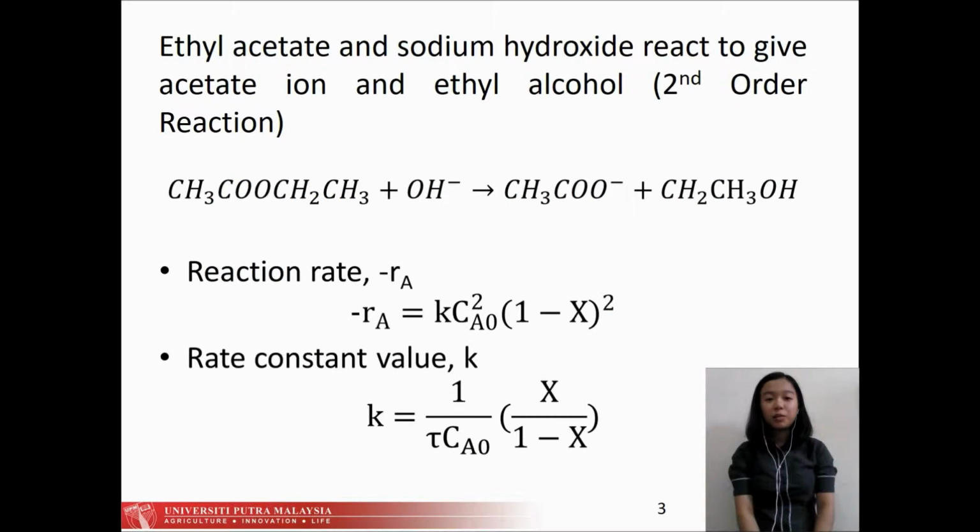Saponification reaction between ethyl acetate and sodium hydroxide forms sodium acetate and ethanol, and this is a second order reaction. The formulas used to find the rate of reaction and rate constant are shown in the slide.